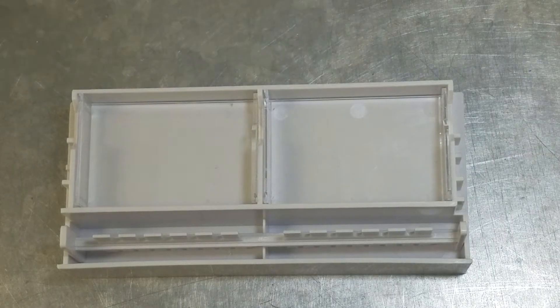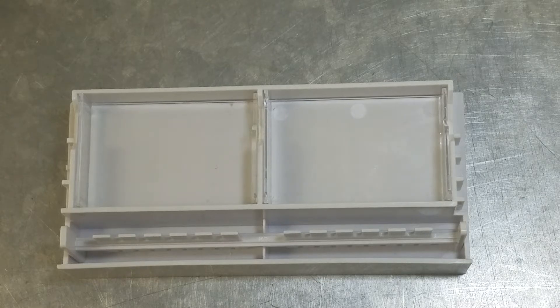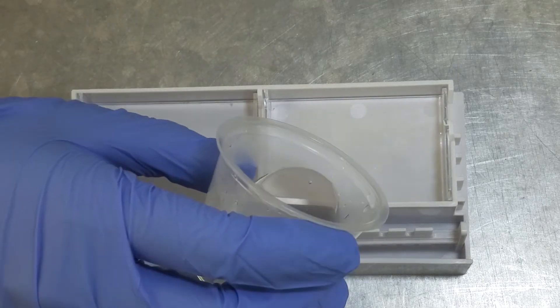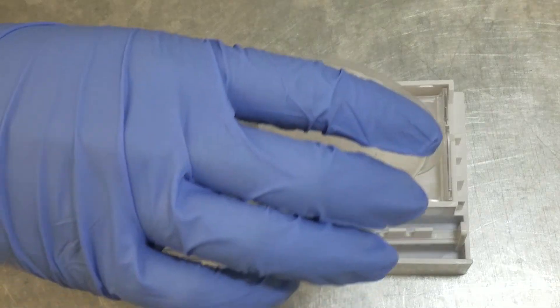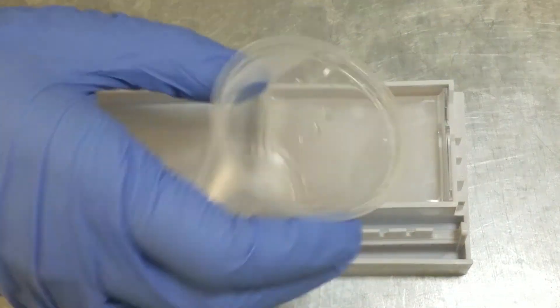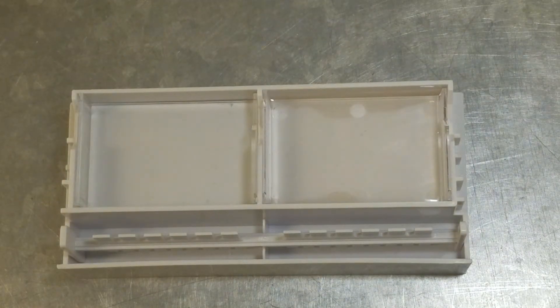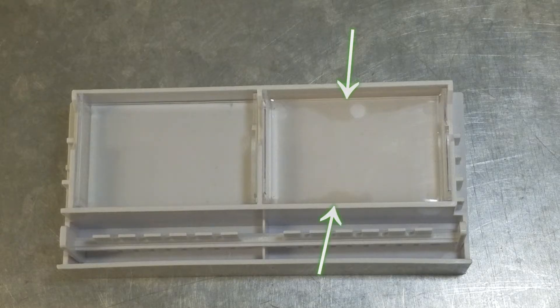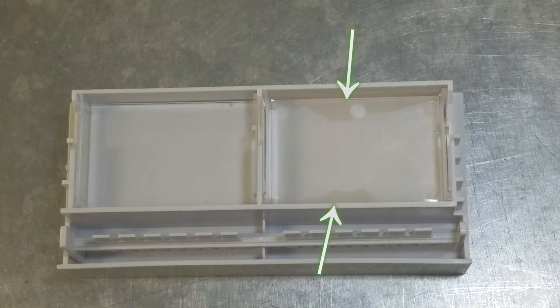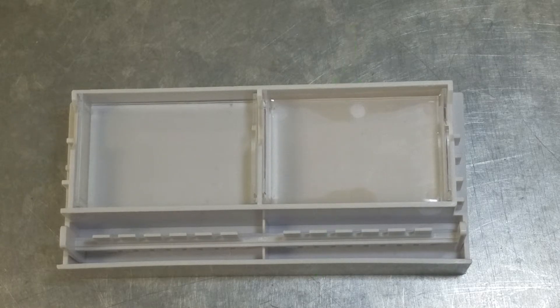Then pour the contents of one gel cup into a single gel casting tray, which is on one side of the casting stand. Again, one gel cup only makes one gel. Some of the agarose may seep underneath the gel tray. Don't worry, the gel will still run.